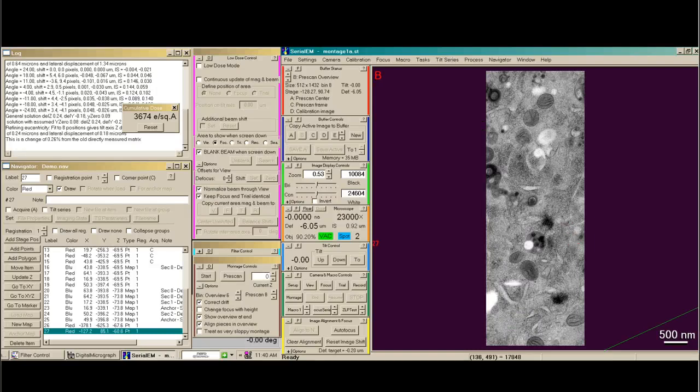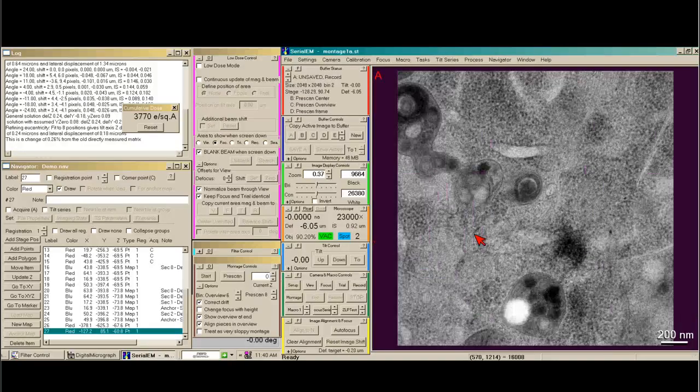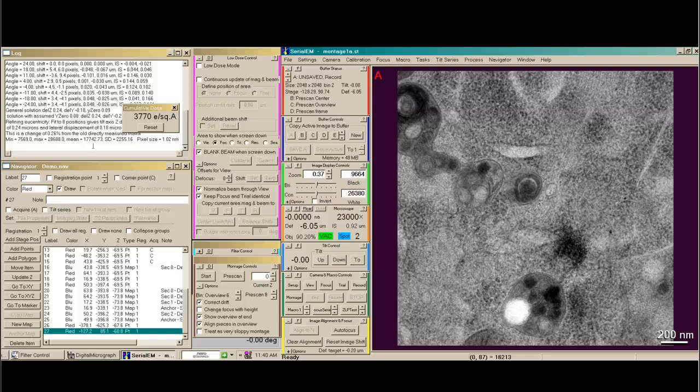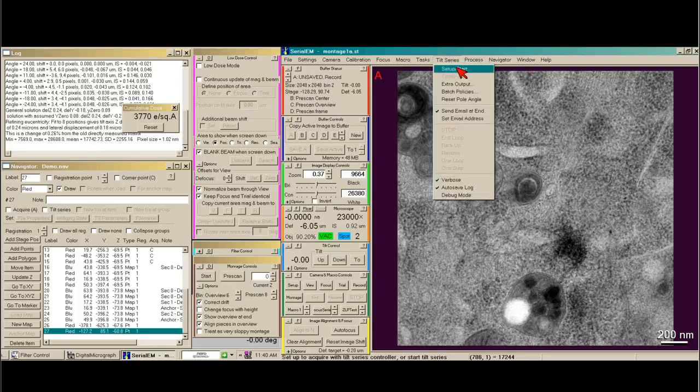I think this looks fine. So now I'm ready to take my record image that will be used to align the tilt series from the beginning. I'm going to check the min-max mean — you can either use the menu system or the hotkey. I have 17,000 counts. This is pretty good, so I'm ready to set it up.